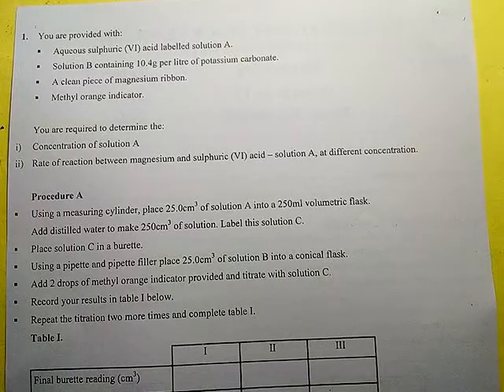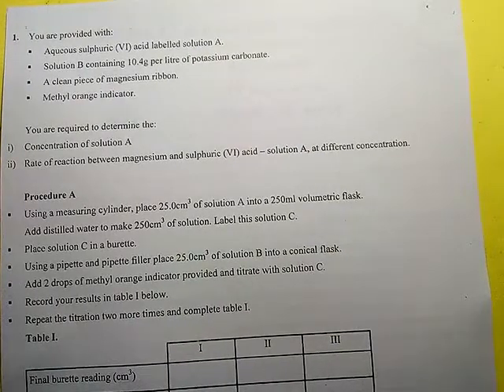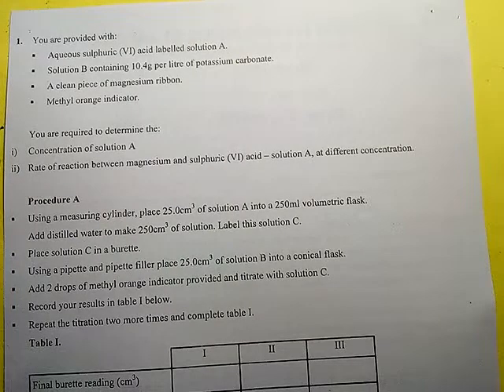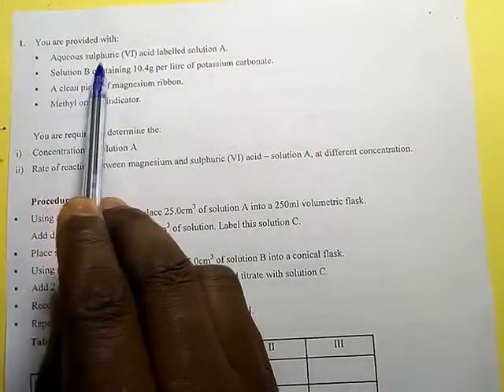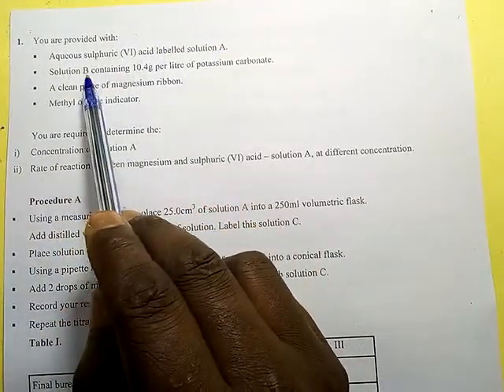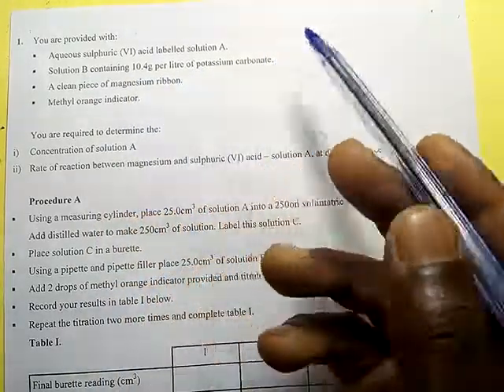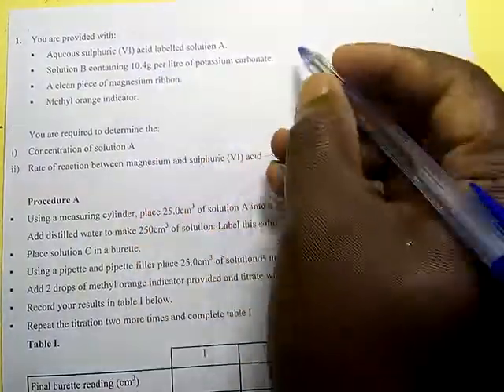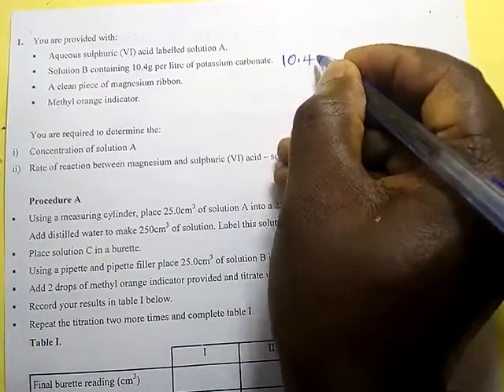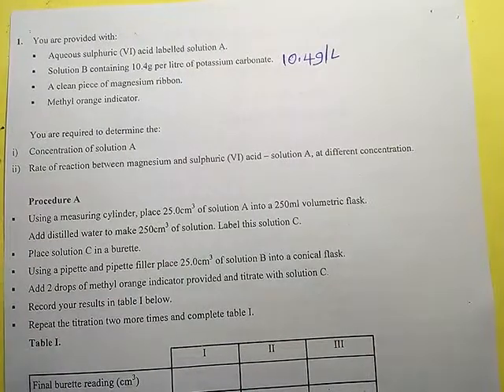I would want to take you through this question. Practical question, paper 3 in Kenya. You are provided with aqueous sulfuric acid labeled solution A, solution B containing 10.4 grams per liter of potassium carbonate. So this one is the mass in 1 liter, therefore it is important to write down that this is the mass in grams per liter. It is important to note that.